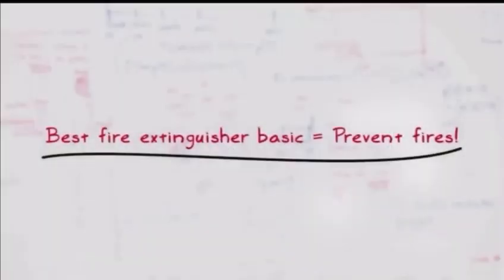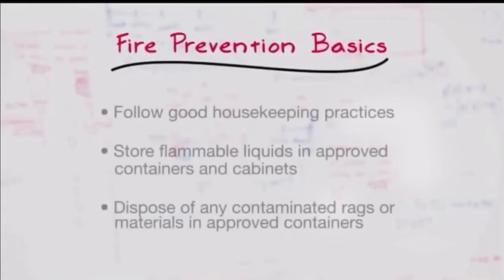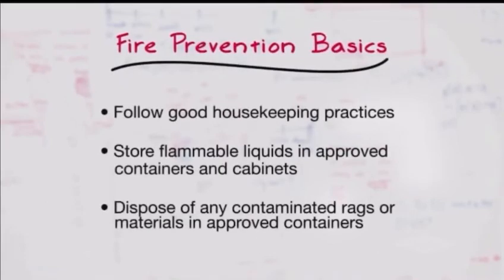And this may be the best fire extinguisher basic of all. Take action now to prevent fires in the first place. Keeping the lab clean, using good housekeeping practices and being vigilant are three easy and effective ways to prevent fires in the lab.